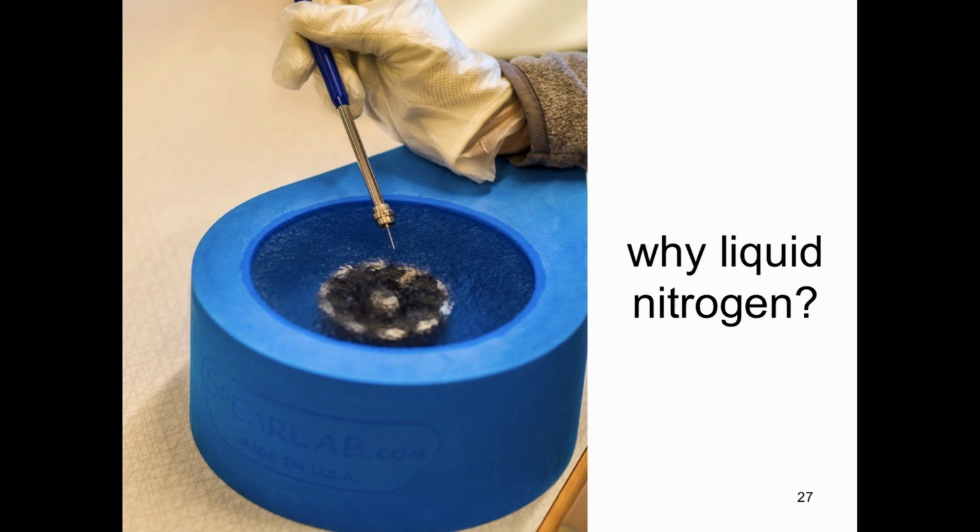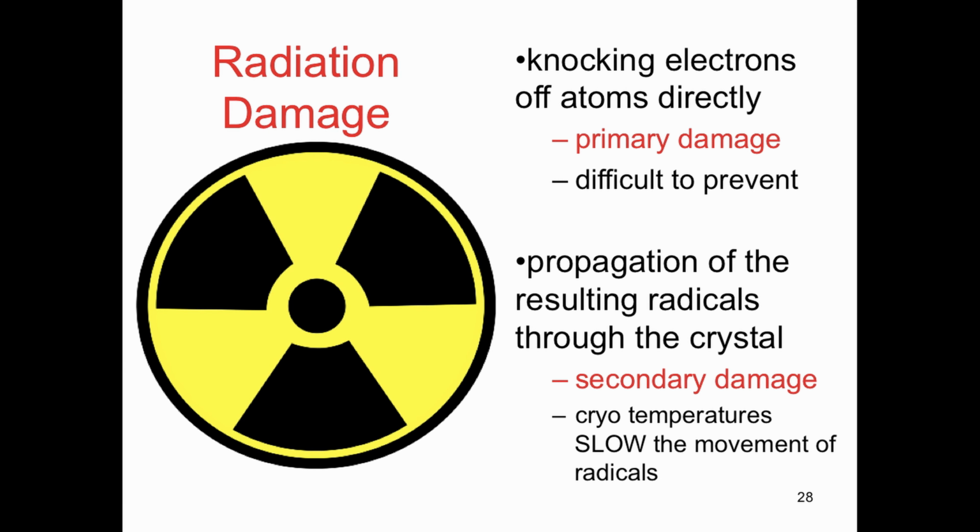Now, why are we using liquid nitrogen? This is to prevent a problem at the synchrotron: radiation damage. There's 2 kinds of radiation damage, of course. The primary damage, where the X-ray beam knocks off the electrons directly from the atoms, there's nothing we can really do about that. It's a law of physics. However, once you knock the electrons off, this generates free radicals, which then propagate throughout the entire crystal.